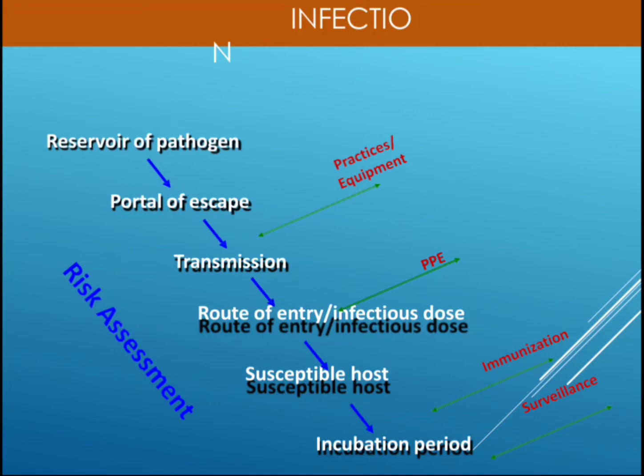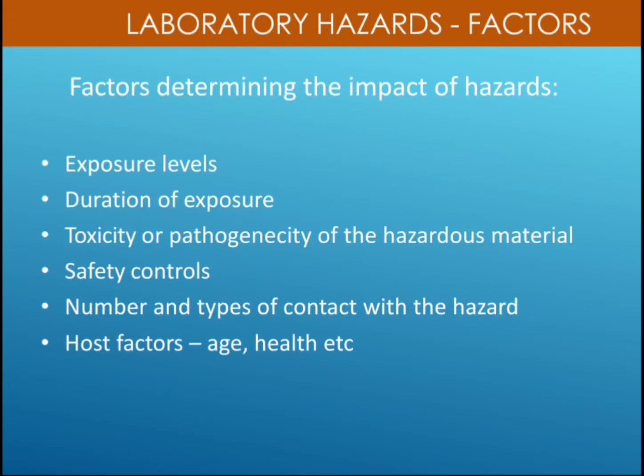Then PPE kits should be used, immunization should be done, and surveillance of the organism should be done properly. Okay, now the laboratory hazards and the factors. What are the factors which determine the impact of the hazards?